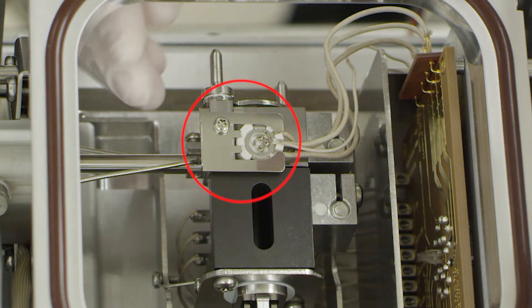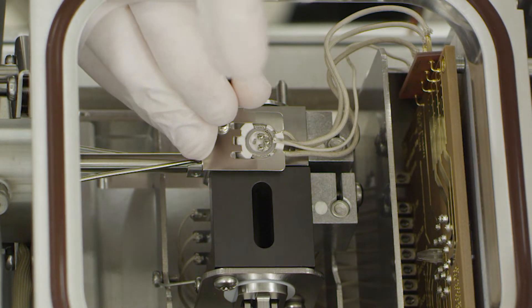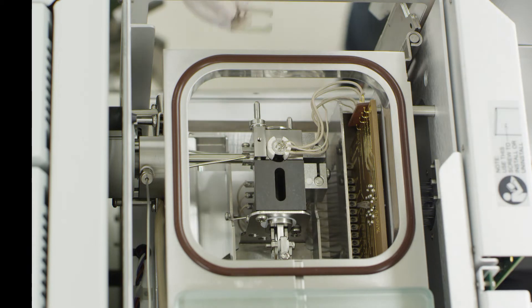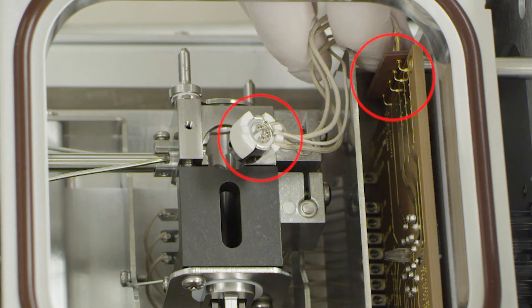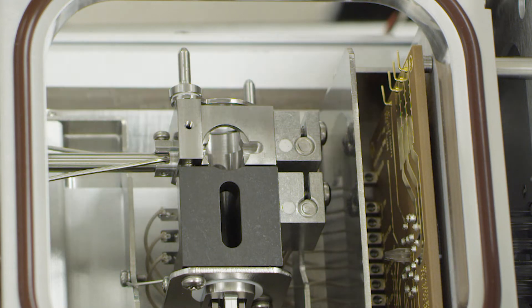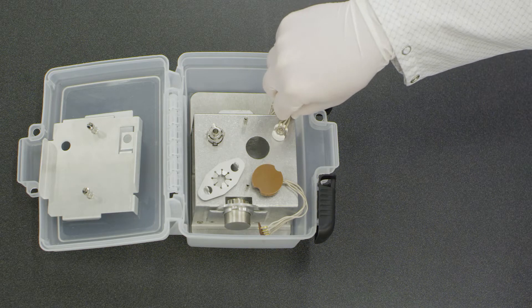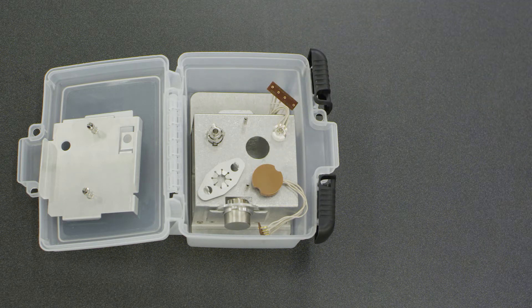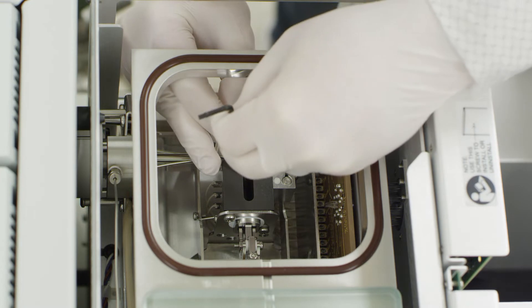Next, locate and remove the filament bracket. With the filament bracket removed, you can now remove the filament from the source interface board. Place the filament in the designated location in the source box. You may now replace the filament bracket for safe keeping.